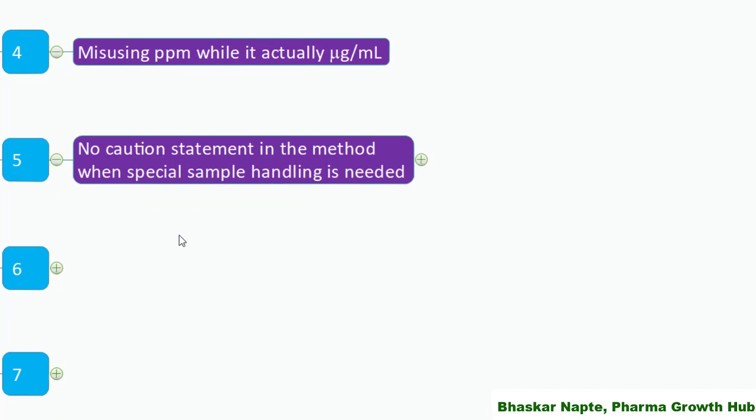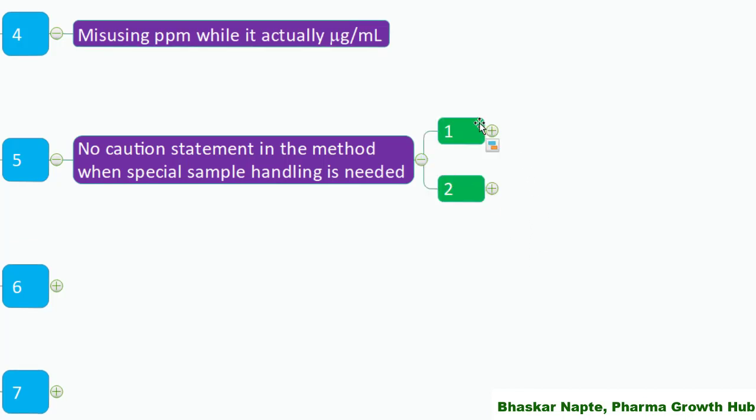No caution statement in the method when special sample handling is needed. Not all sample solutions are equally stable, and chromatographic systems are not robust across all parameter studies. There may be situations where standard or sample solutions are not stable beyond a certain time period, or a drug substance is highly hygroscopic and utmost precaution is needed during weighing — for example, maintaining humidity not more than 60% RH. Those details are very crucial and must be mentioned in the analytical test procedure.